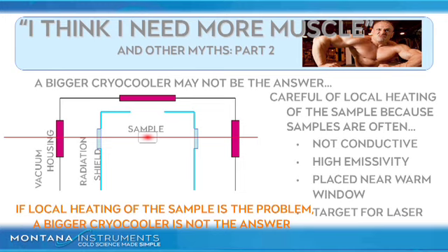If that heat load is local to the sample, then your sample temperature may go up many degrees. Your sample may be at 15 K, and sizing up a bigger cryocooler will not help that problem. A larger cooler might get you a marginal improvement to 14 K. The problem is the temperature depends on the quality of the sample thermal mount to the cold finger. You need to minimize the heat input and optimize the sample mount connection. Hopefully the series can help you do just that.